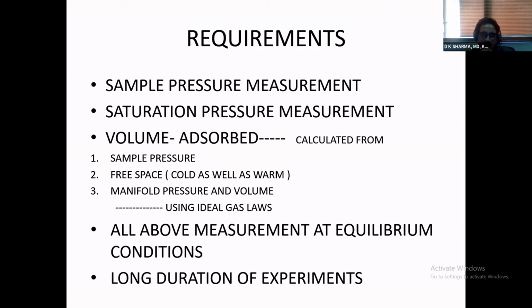And this diffusion, as you know, is a thermally activated process. Low temperature doesn't help it. Actually, a low temperature makes it hard to diffuse, and that's why adsorption is a slow process, especially at very, very low pressures. It takes long times to complete the total experiment.